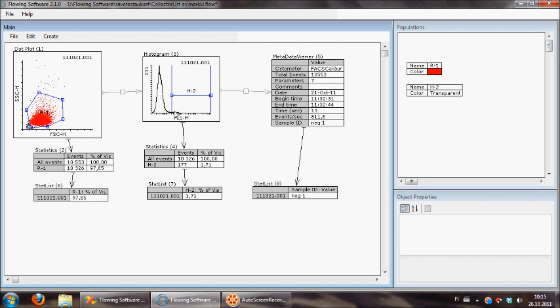And then he would like to know the amount of FITS positive cells, or GFP positive cells in fact, and it's this gate. He has also saved sample ID which tells which kind of sample this was.